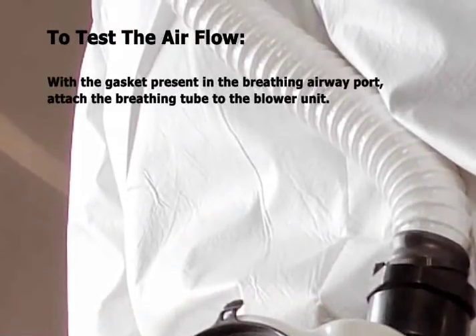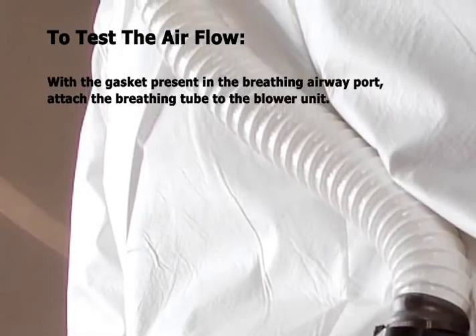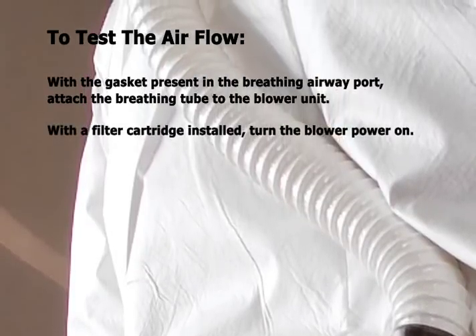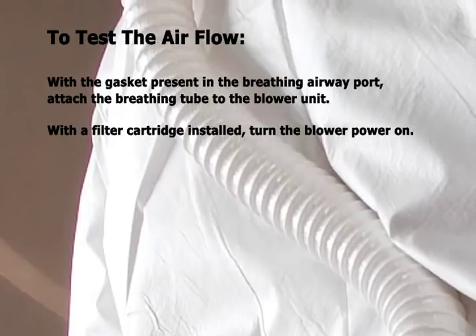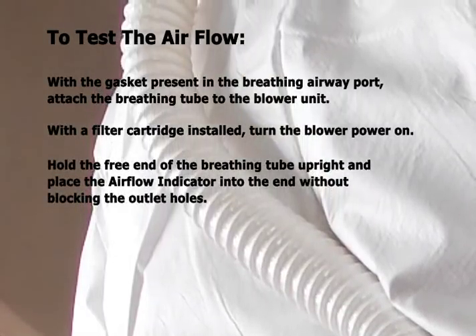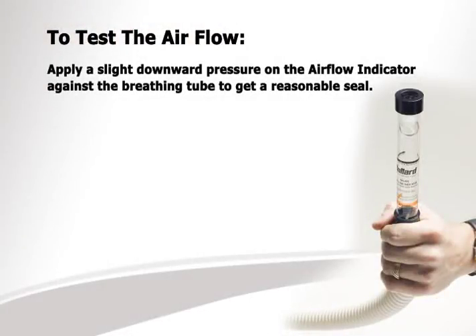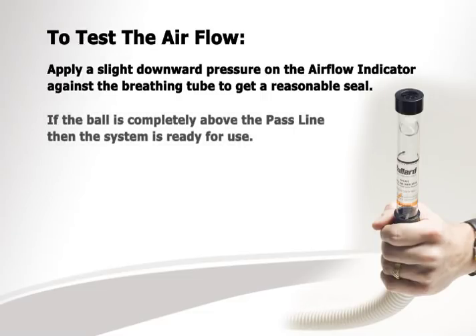To test the airflow, with the gasket present in the breathing airway port, attach the breathing tube to the blower unit. With the filter cartridge installed, turn the blower power on. Hold the free end of the breathing tube upright and place the airflow indicator into the end without blocking the outlet holes. Apply a slight downward pressure on the airflow indicator against the breathing tube to get a reasonable seal. If the ball is completely above the pass line, then the system is ready for use.